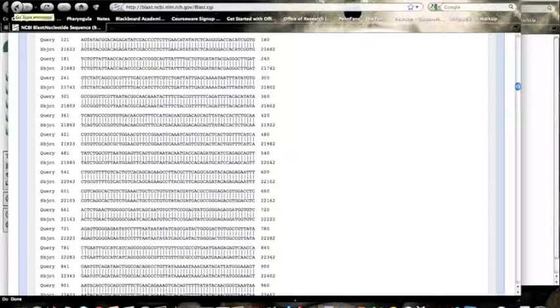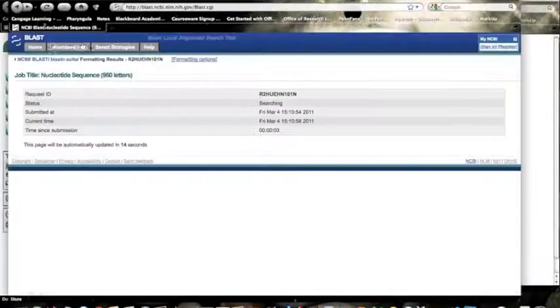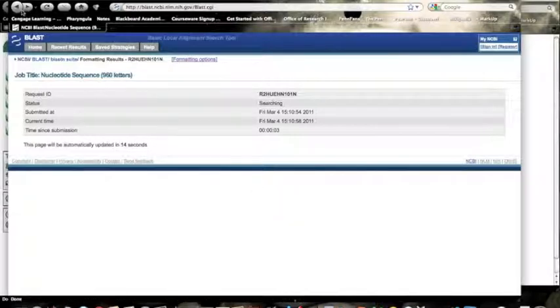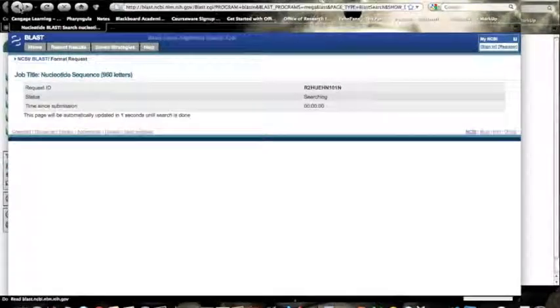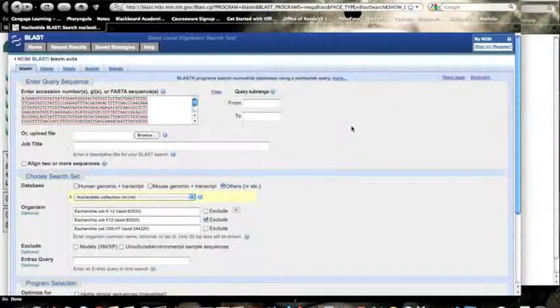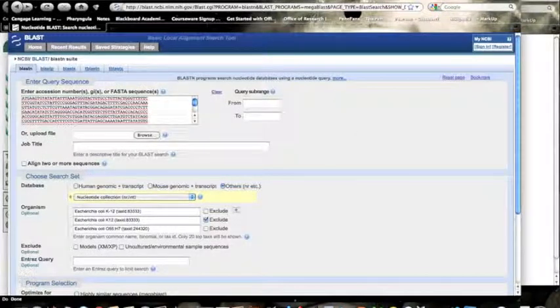Now, for the next part, if we're looking for some neighborhoods that match up, we could then search through other organisms where we might have found it. And we just looked through the pathogenic strain.